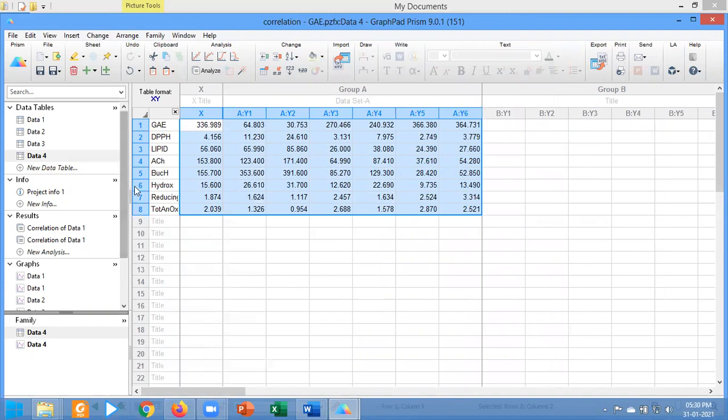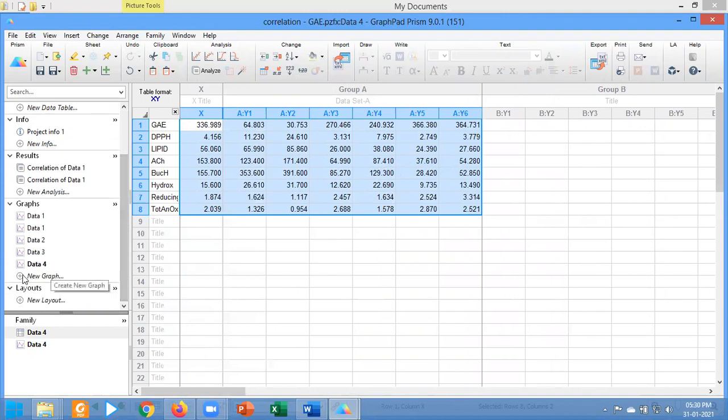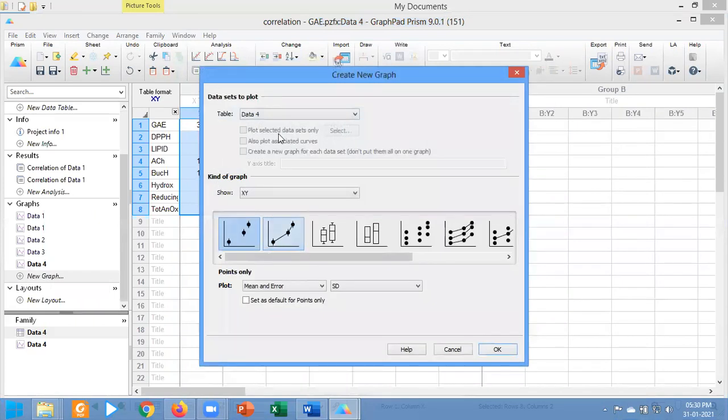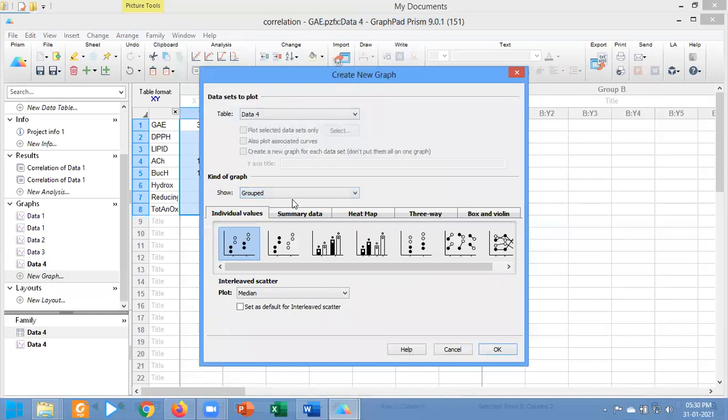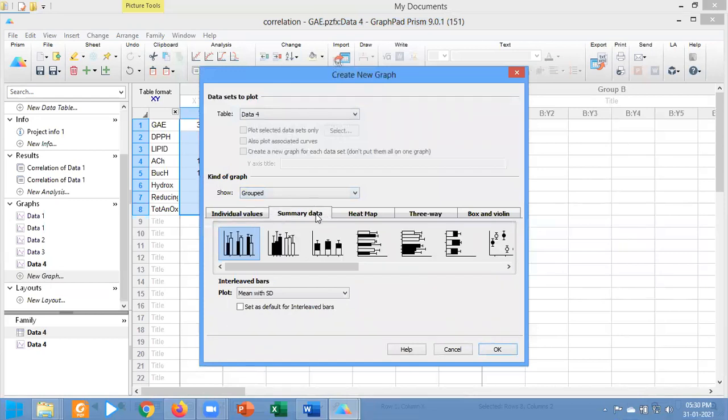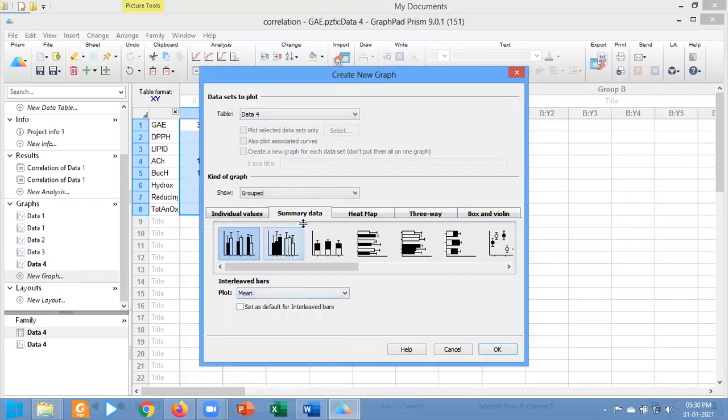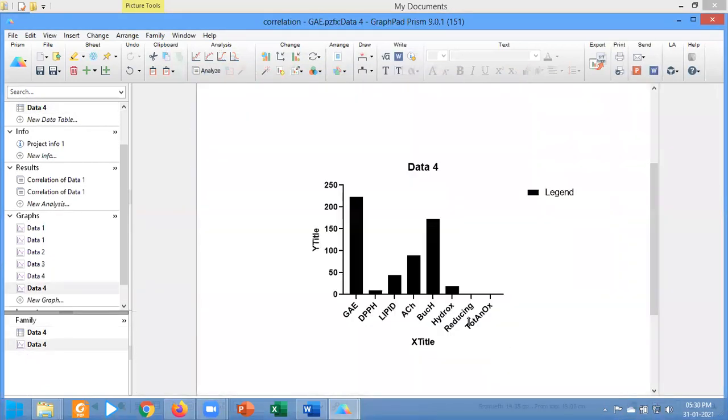Now I have to draw the graph. Click on the graph portion, select grouped, select summary, select only mean, click on okay, and you see that this is the data.